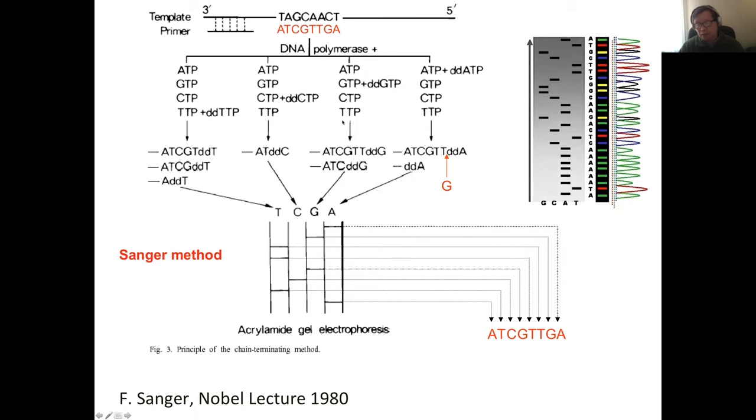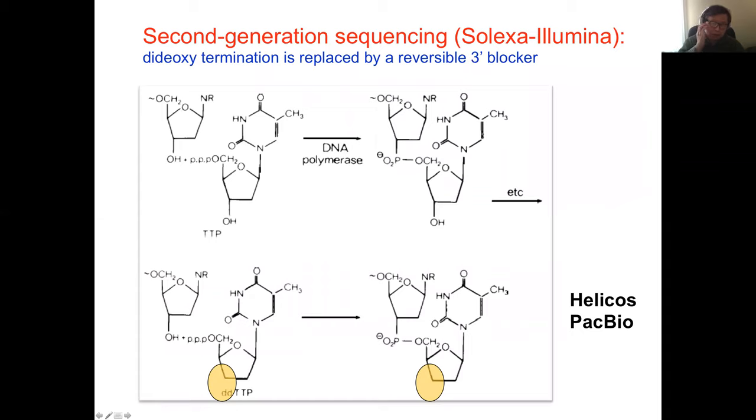So then later it was made a little fancier, but the basic idea is the same, and you can see that it's a perfect match. So it's a perfect match here, okay? So that's the idea, okay? And then of course, everyone knows that to do whole genome sequencing would be too difficult.